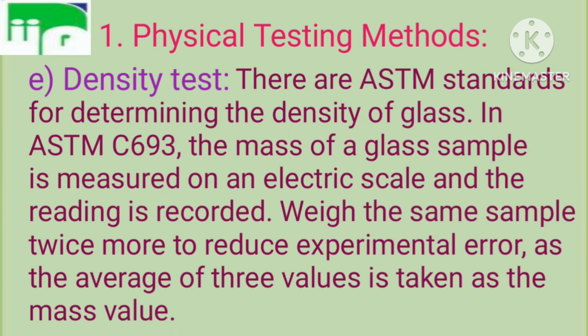Next is density test. There are ASTM standards for determining the density of glass. In ASTM C693, the mass of a glass sample is measured on an electronic scale and the reading is recorded. Weigh the same sample two more times to reduce experimental errors, as the average of three values is taken as the mass value.